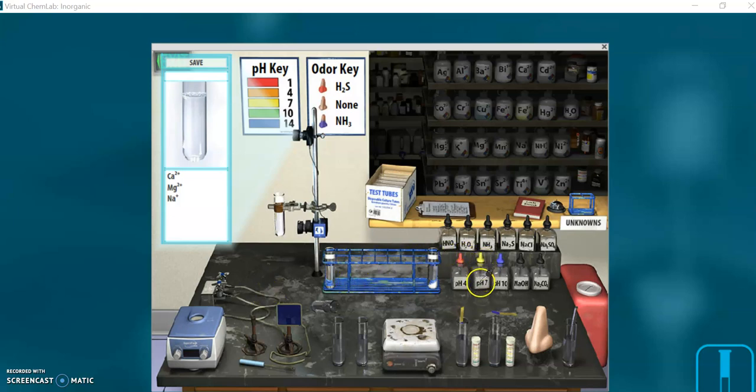So first, I'm going to go over to the pH 7 bottle. Click on that. You can hear that it does something. I can test it with the pH paper if I want to show that it's 7. If I do, it should look yellow here.